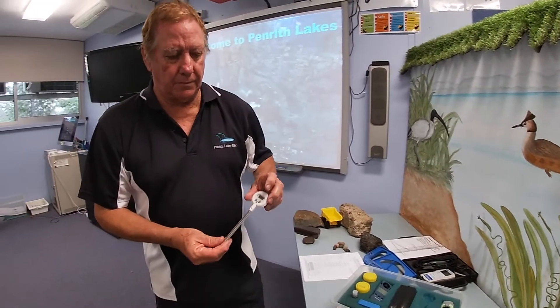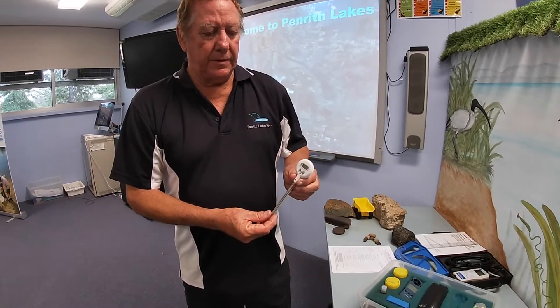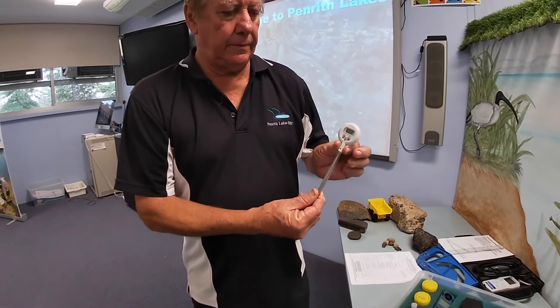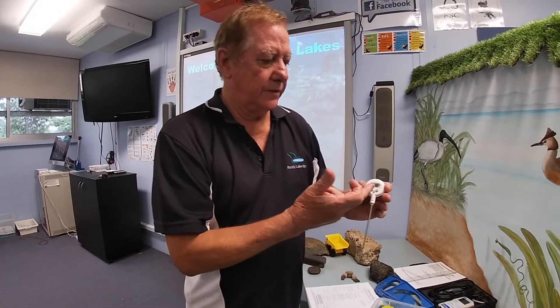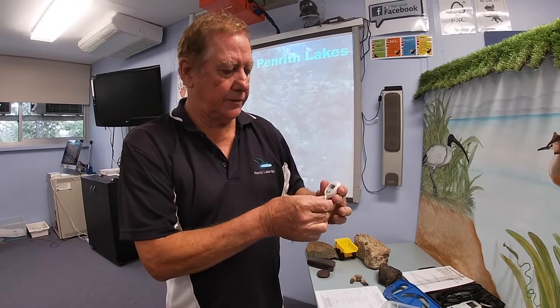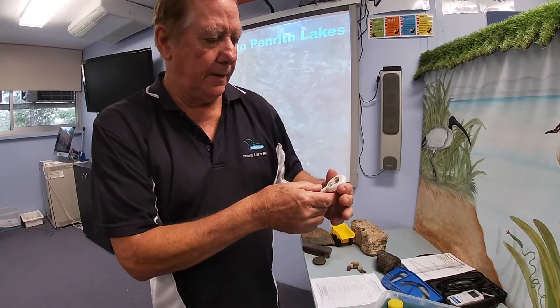So how do we do the test? We use a digital thermometer. It has a sleeve on it — we take the sleeve off, and it has an on/off button. We press the on/off button in the middle.